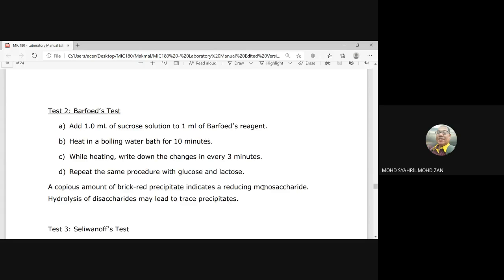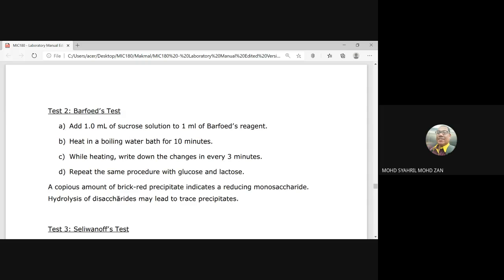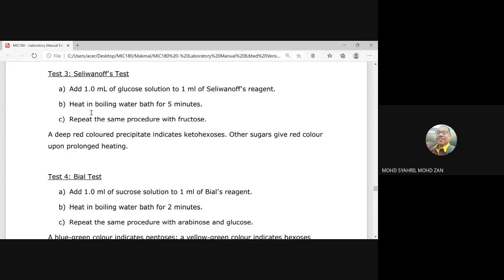Test 3 is the Seliwanoff test. Add 1 ml of glucose to 1 ml of Seliwanoff reagent and heat in a boiling water bath for five minutes. Repeat with fructose. The expected result: a deep red color precipitate indicates a ketohexose — hexose meaning a six-carbon ring, keto being one type of monosaccharide. Other sugars will give a red color only upon prolonged heating.